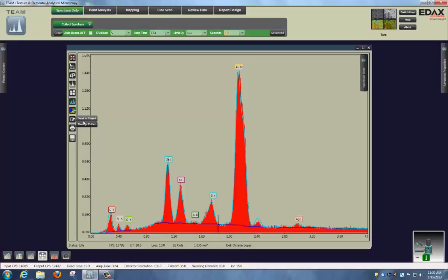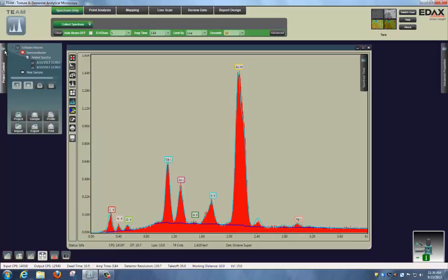And we have our animation, or sending to folder by clicking on Send to Folder. And what that means is that I added my spectra, I sent to the project, and now my spectrum is saved here in the project panel.